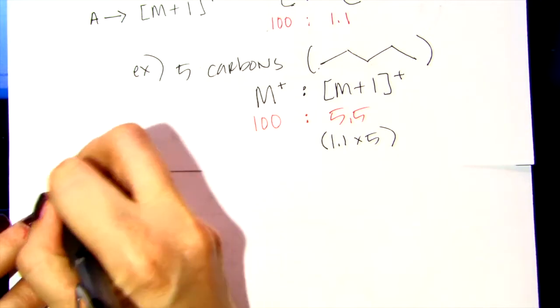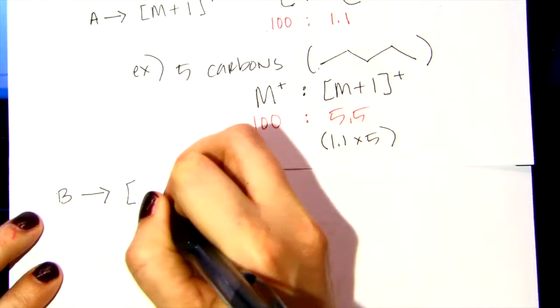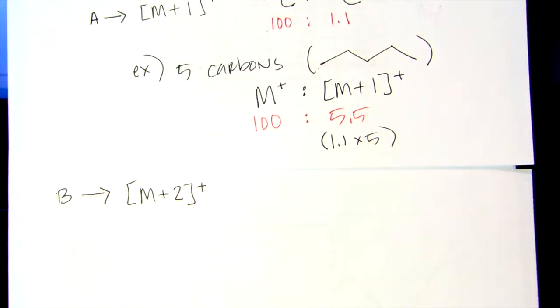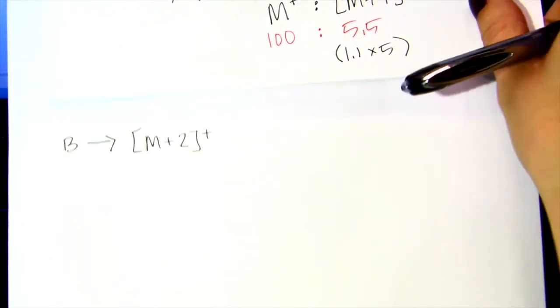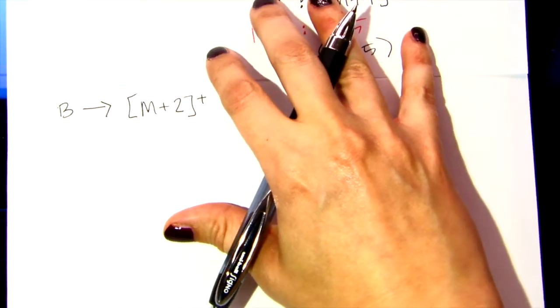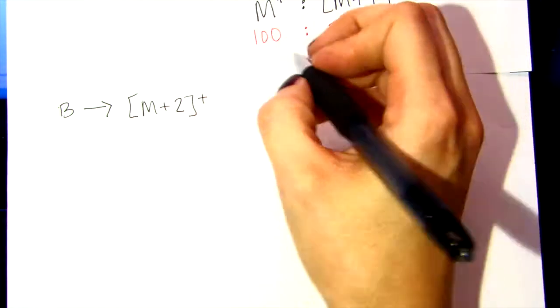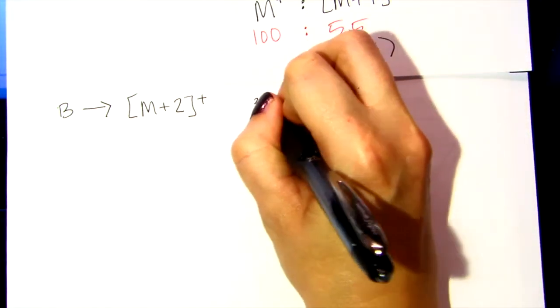Okay, so the next peak that you would encounter, peak B, the second peak, is the M+2 peak. So we're going 2 above what your mass peak is. Okay, and carbon-14 is very low abundance, so you're not really going to see carbons there, but this is where you start to see heteroatom evidence. The ones that are most common are chlorine, bromine, and sometimes sulfur.